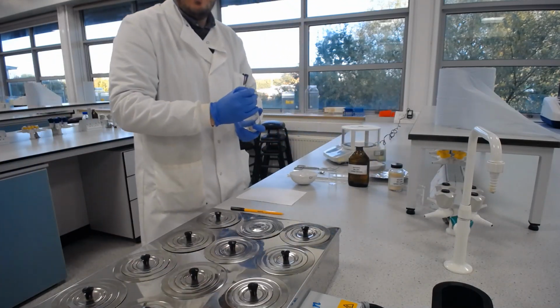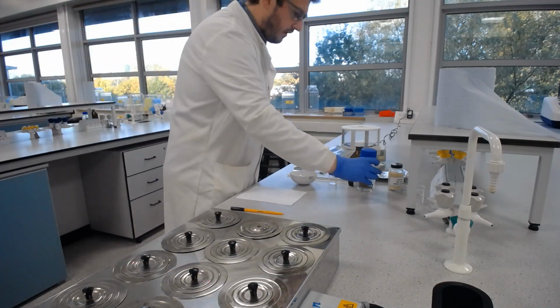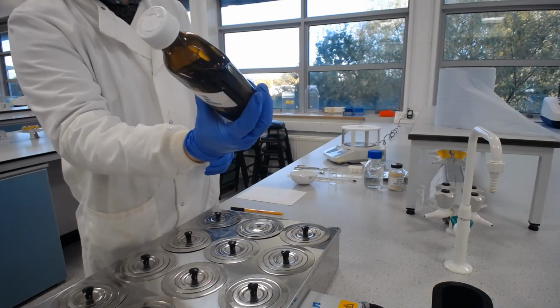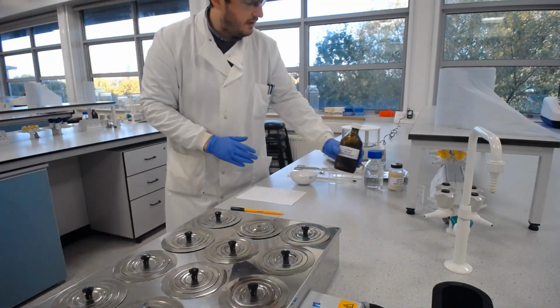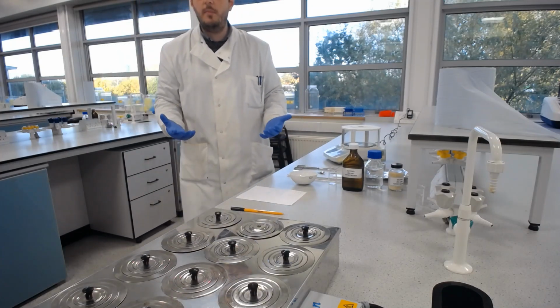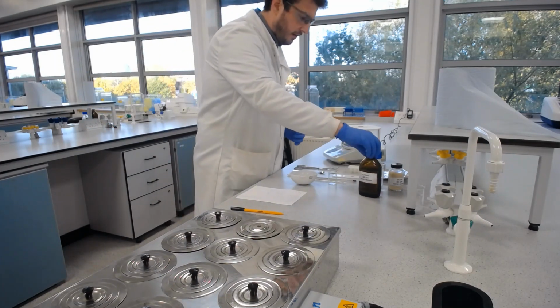I've got some distilled water here, just to save me going to the sink and back, so we've all got our own water to use. And glycerol in this bottle here, which is obviously a very viscous, gloopy sort of liquid, which is actually the active ingredient for these suppositories. It acts as a mild irritant as it goes into the bowel to stimulate peristalsis, to stimulate you to go to the toilet. So I've got all my ingredients there.